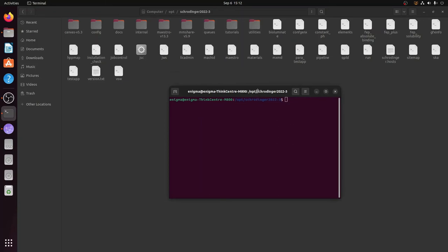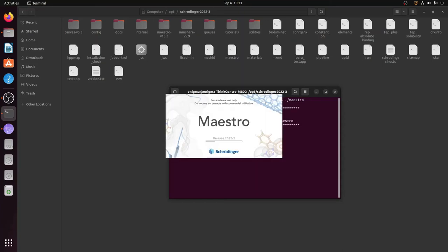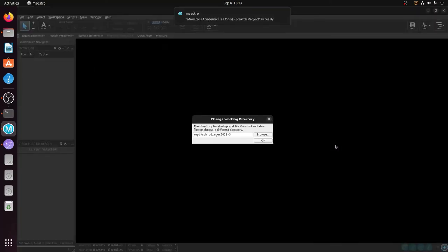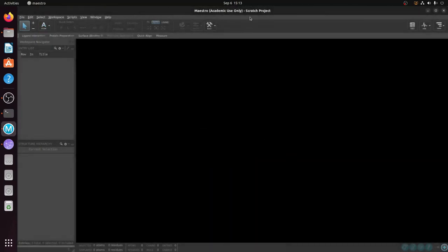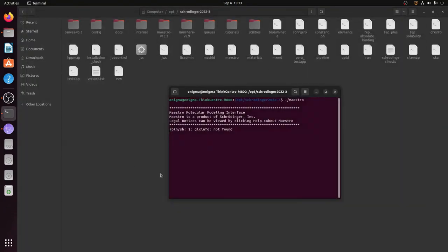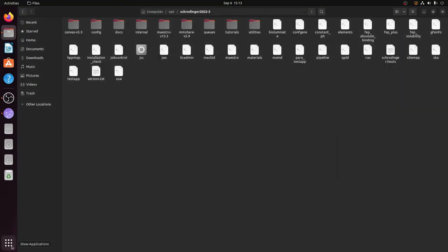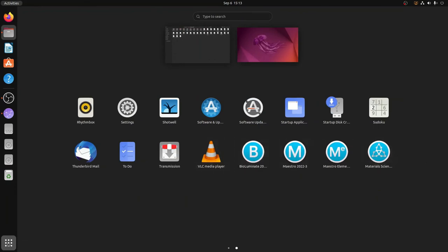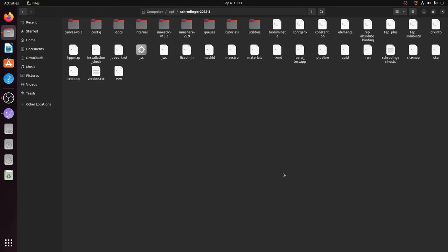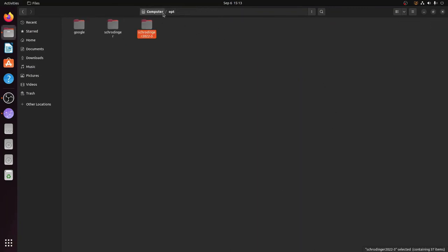We are now in the terminal inside the folder 'schrodinger2022-3'. To open Maestro from the terminal, simply type './maestro' — the name must exactly match — and hit Enter. Maestro will open once again. This is the way to open Maestro if the desktop icons fail to appear. I will close it and now proceed to uninstall Schrodinger.